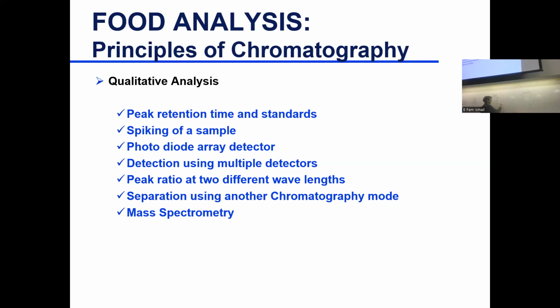And then here is your signal, absorption or whatever. It gives you a signal at every wavelength. So this is a unique fingerprint to a particular compound. So oftentimes we can tell compounds apart based on their light absorption fingerprint.